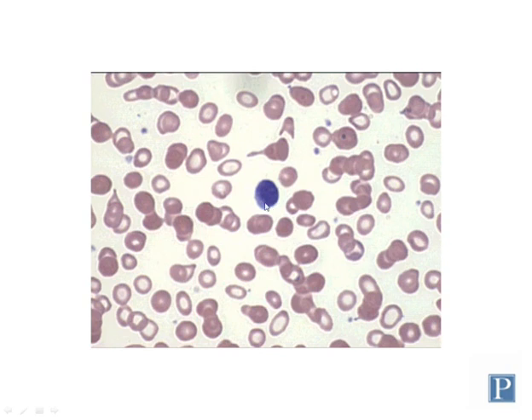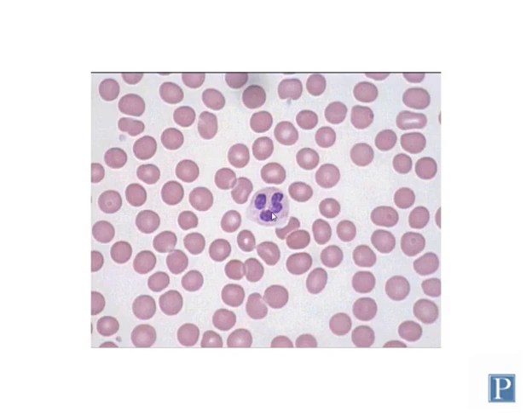Here is, just for review, a lymphocyte, and right here we have another neutrophil. So that's it for this week. Make sure you are able to identify all of those structures, and that's it.